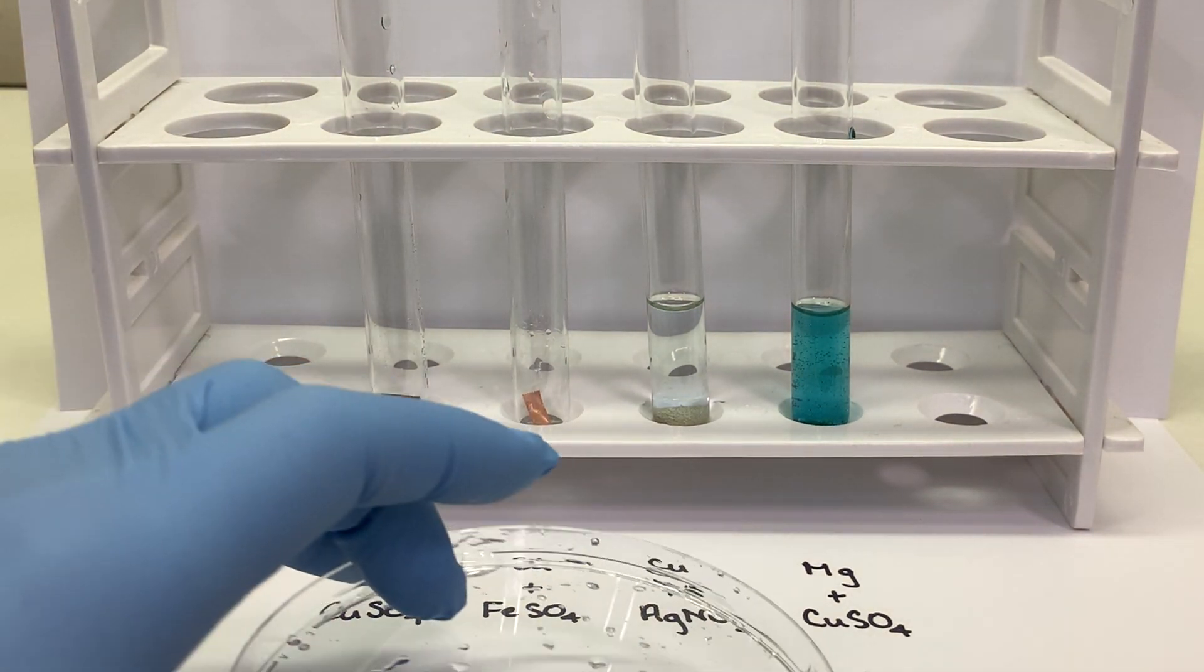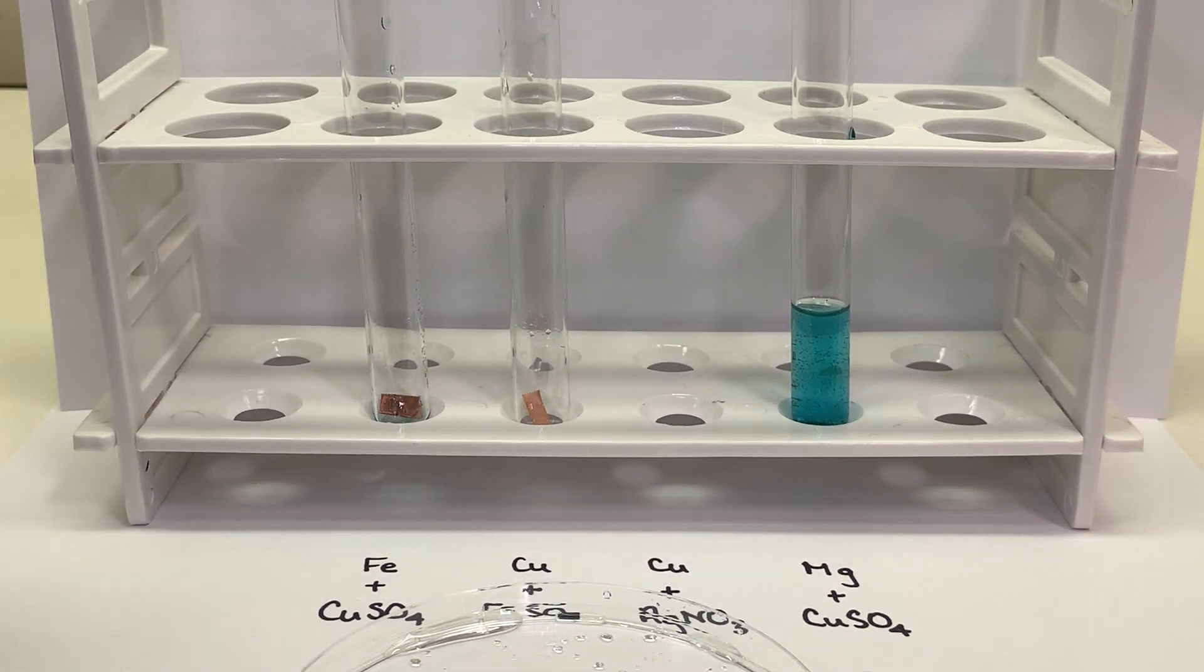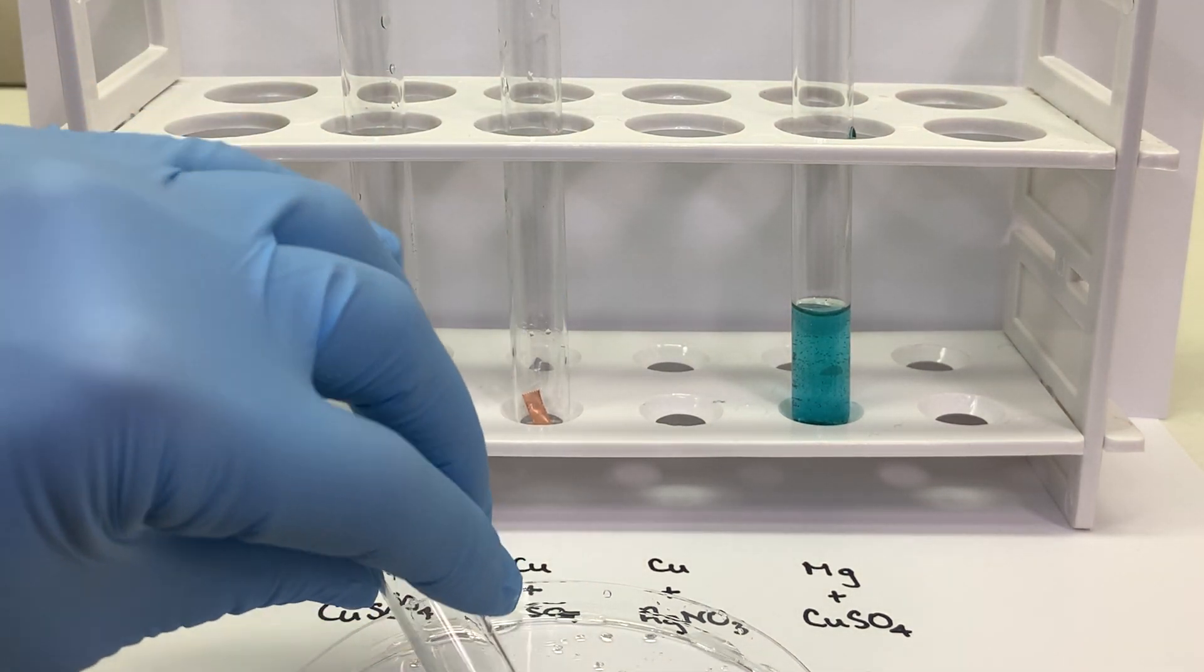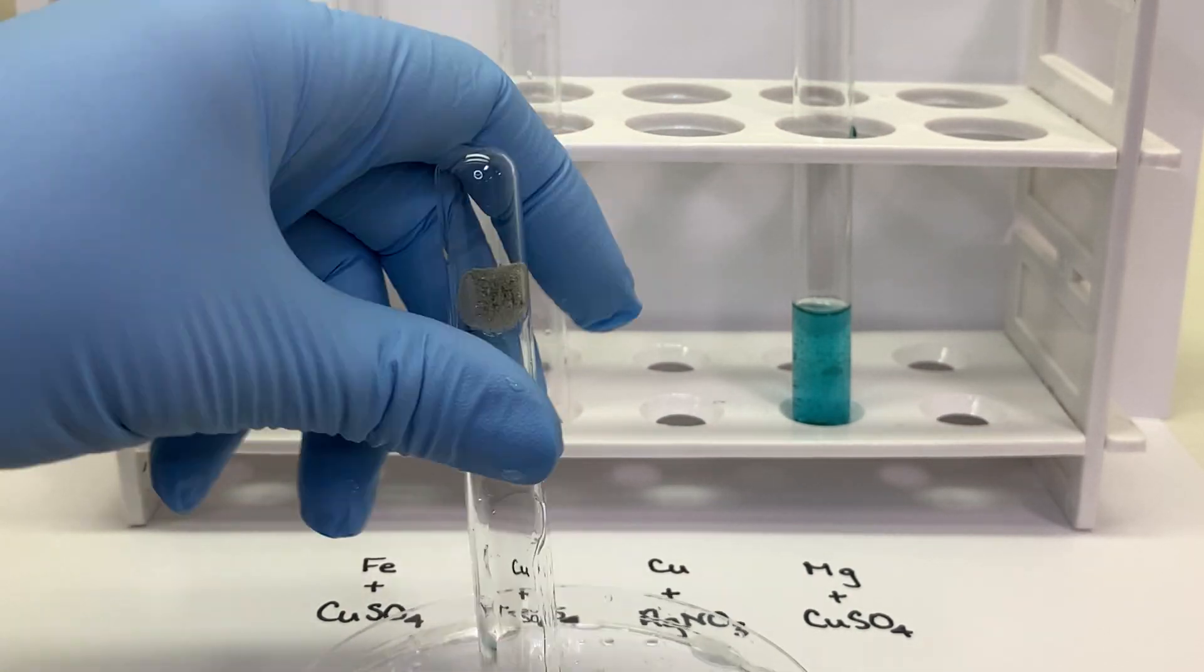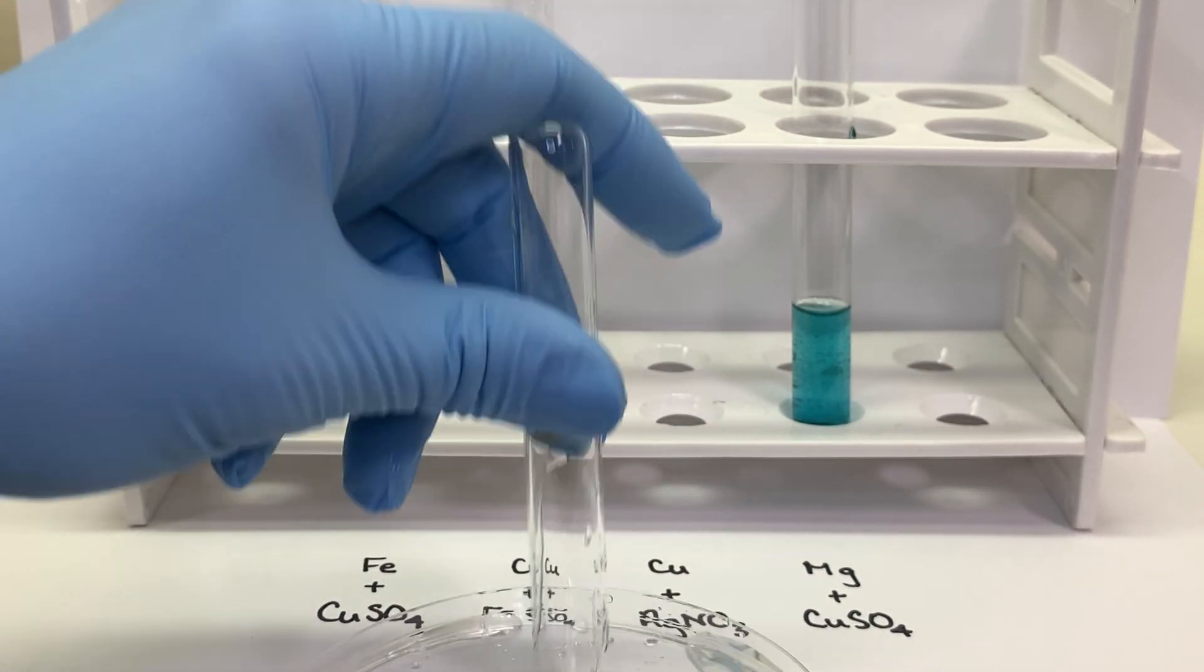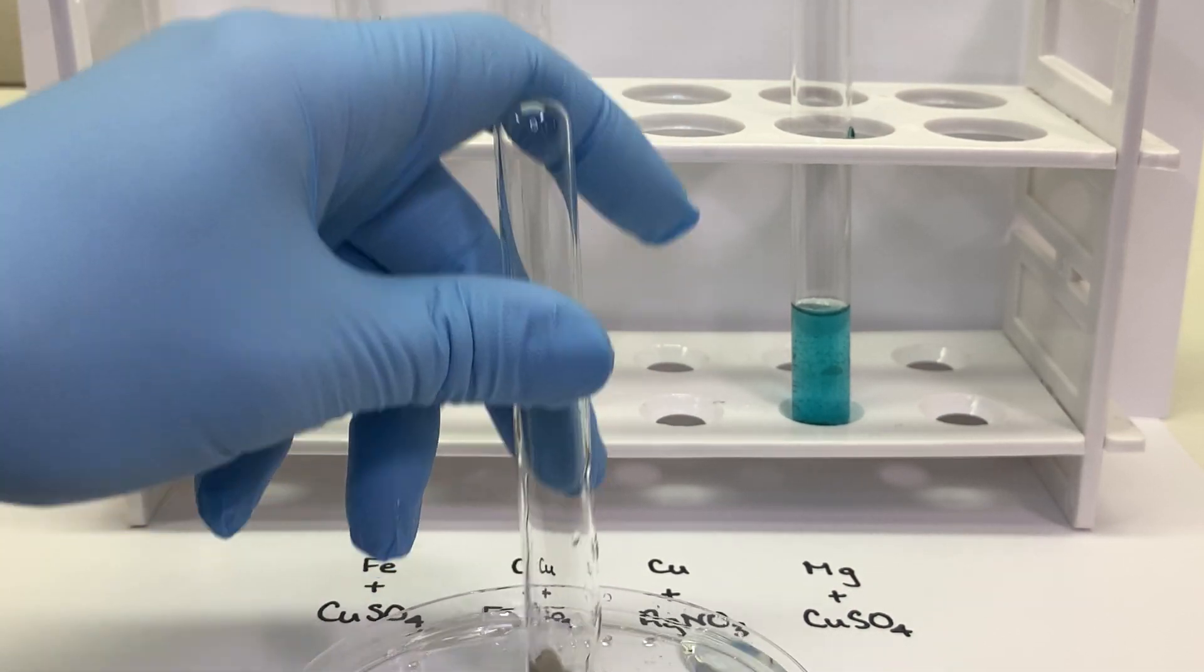Okay, our third combination was copper and a silver 1 nitrate solution. I'll try to get that out, it kind of got stuck at the bottom of the test tube, but you can sort of see what it looks like as I'm getting it out here.